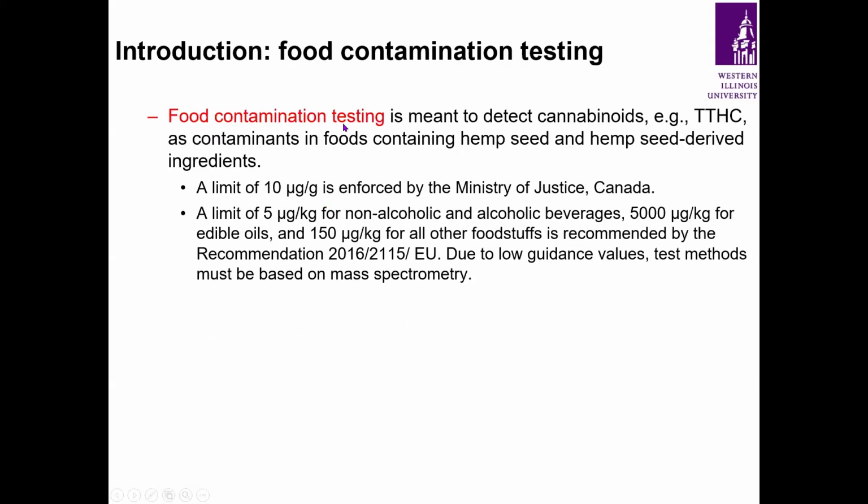Food contamination testing is meant to detect cannabinoids as contaminants in food containing hemp seed and hemp seed-derived ingredients. It is required in Canada and in the EU.